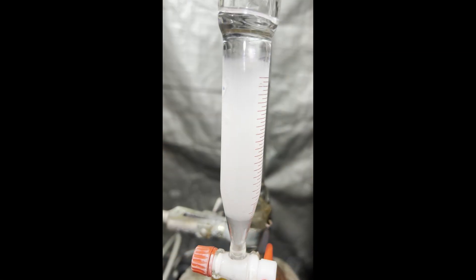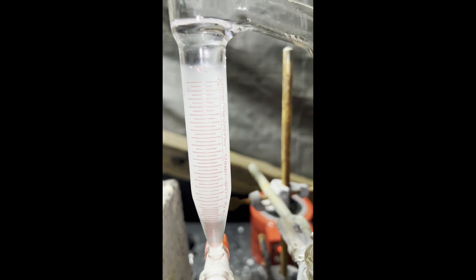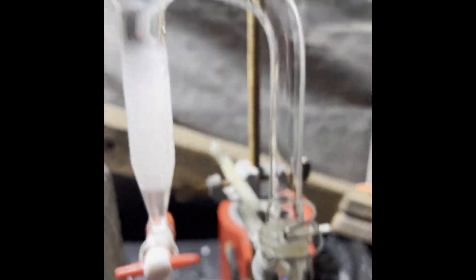I ended up refluxing the mixture with the Dean-Stark trap for about 6 hours — the patent recommends 3 hours — and I probably could have stopped after 3 hours, but I wanted to be sure no more water produced was coming over.